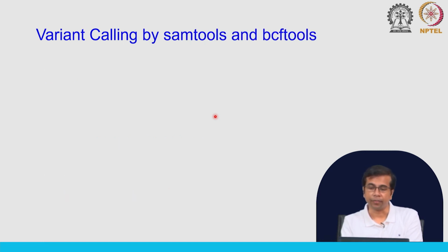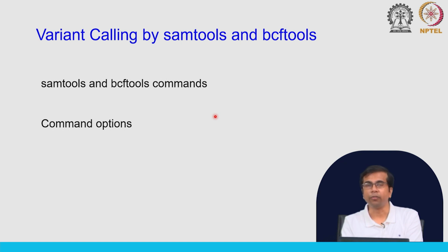So, what we will do is we will look into these SAMtools and BCFtools commands. Of course, there are many options, and not all of them are required in this class, and also the time will not permit, so we will look at the command options that are available.